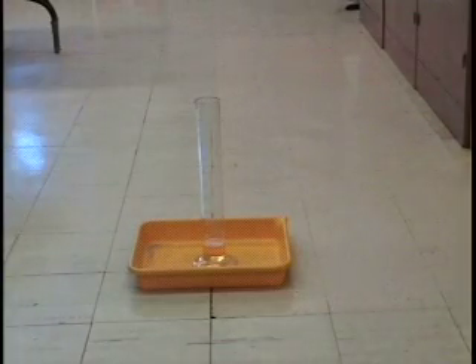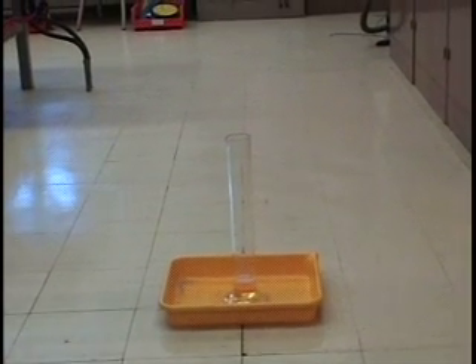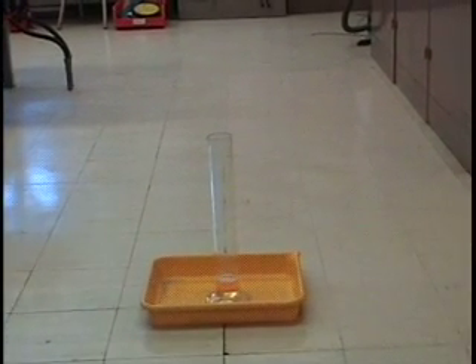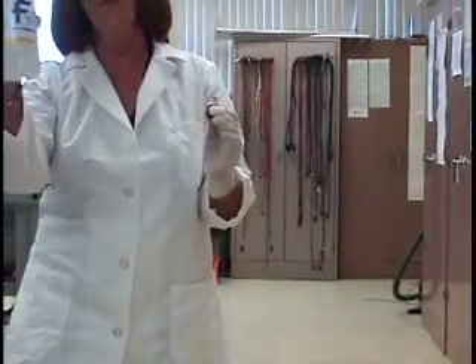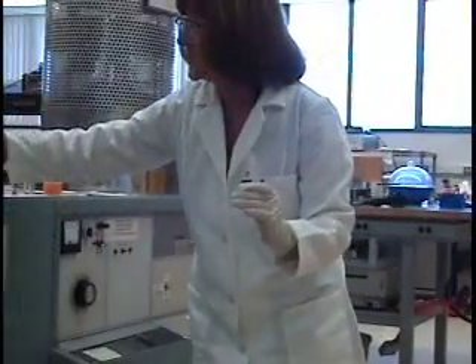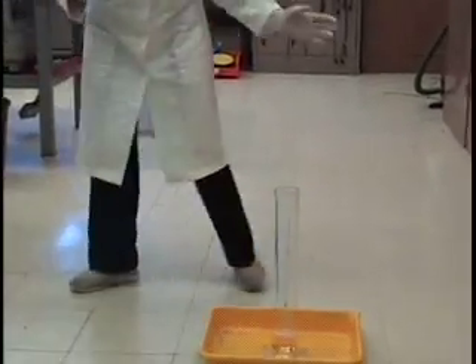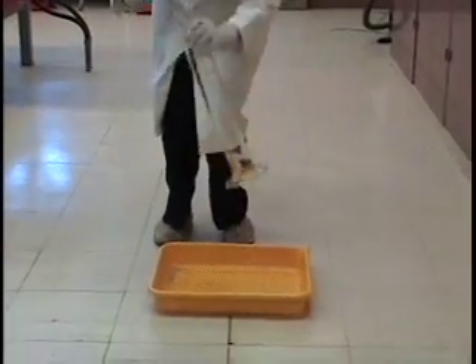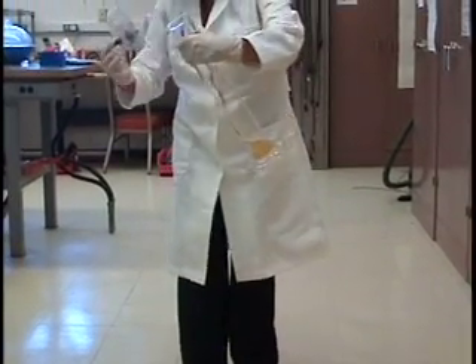We're going to see the possibility for this hydrogen peroxide. This is much more concentrated than what you would use as an antiseptic, because that's 3% and this is 30%. And to make this a little more dramatic and a little more patriotic, we're going to put some food coloring down the sides.